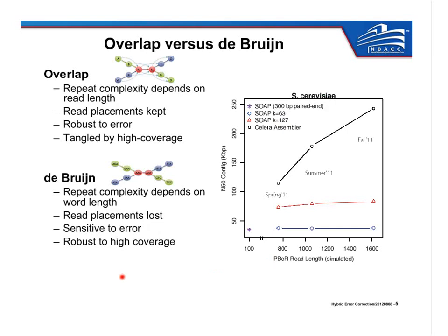So our initial intuition was to go with the overlap-based approach because if we're going back to the puzzle analogy again, the overlap-based approach takes the puzzle pieces as they come into the assembler. So if you have a 5,000 base read, it gets treated as 5,000 bases. In a De Bruijn assembler, on the other hand, they generally shred the reads down to a fixed k-mer length that's shorter than the read length. So say your k-mer size is 100 bases. Your reads coming in as 5,000 bases will get shredded down into 100 base pieces. This didn't make a lot of sense to us.